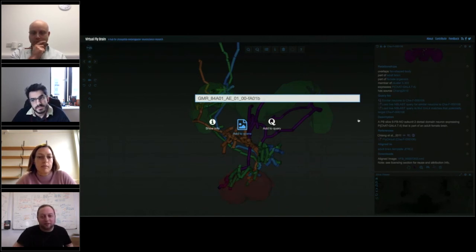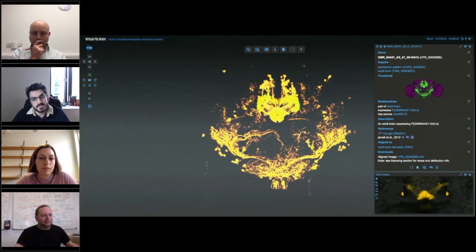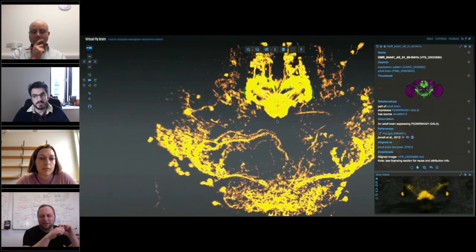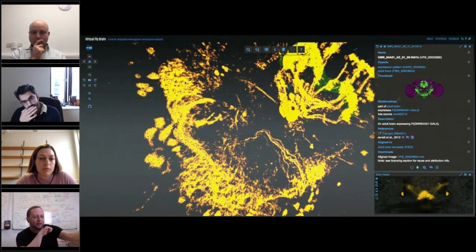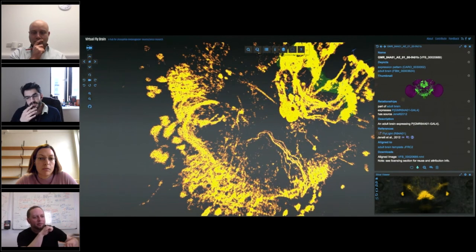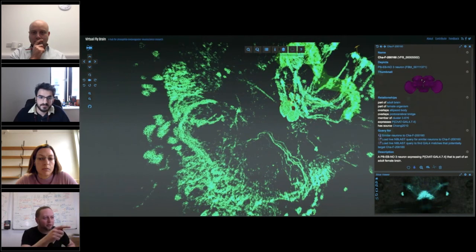As we were saying earlier, that may not be a perfect match, but previously you would have had to look through several thousand expression patterns to hit a particular target. Here you find one that does follow the line through. It's a bit easier to see in the 2D slice, but I'll go through one live in a second.